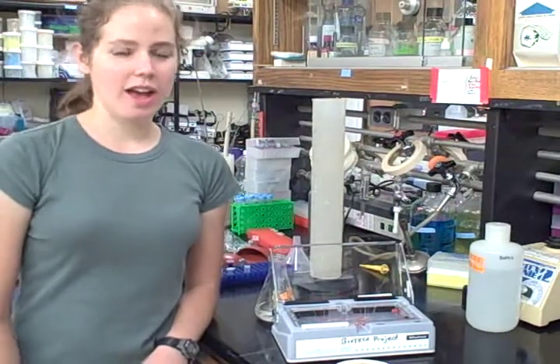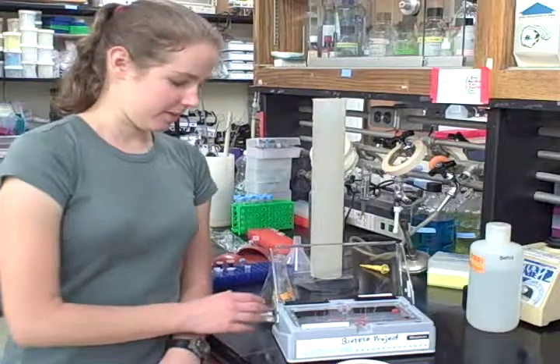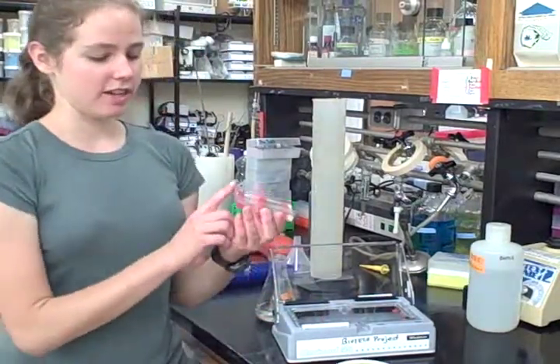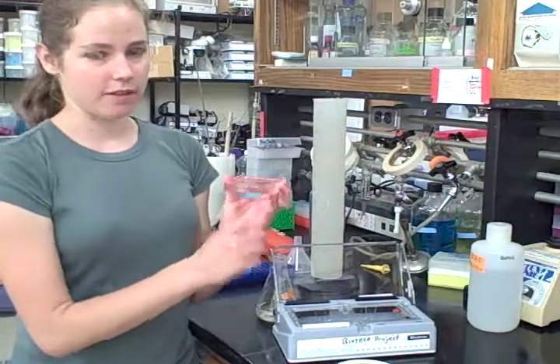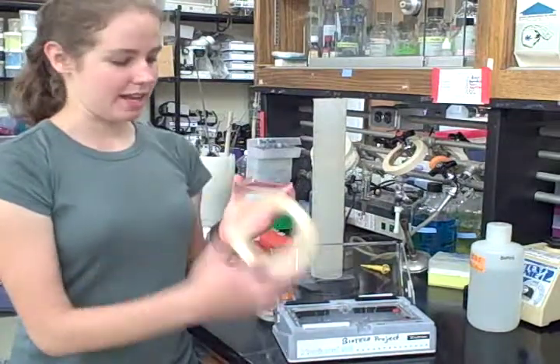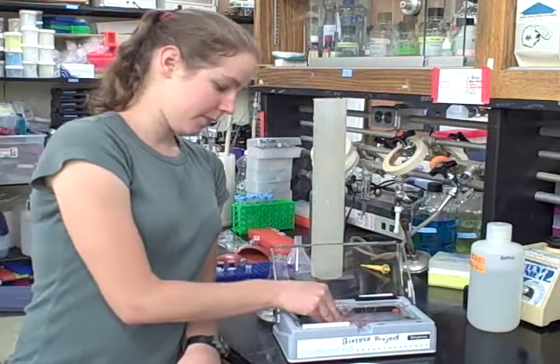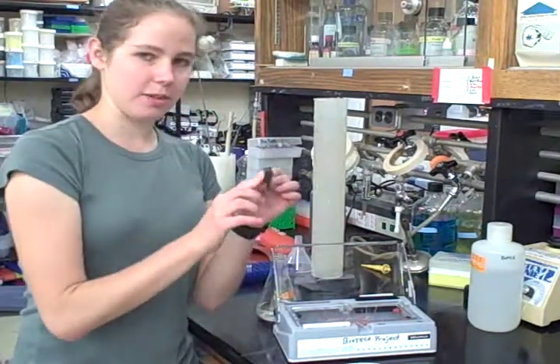I'm going to teach you how to pour an agarose gel. Before you pour the gel, you want to make sure that either end of the cast is closed off. You can either do this with masking tape or, in the case of this gel box, you can use the stoppers that come with the box.